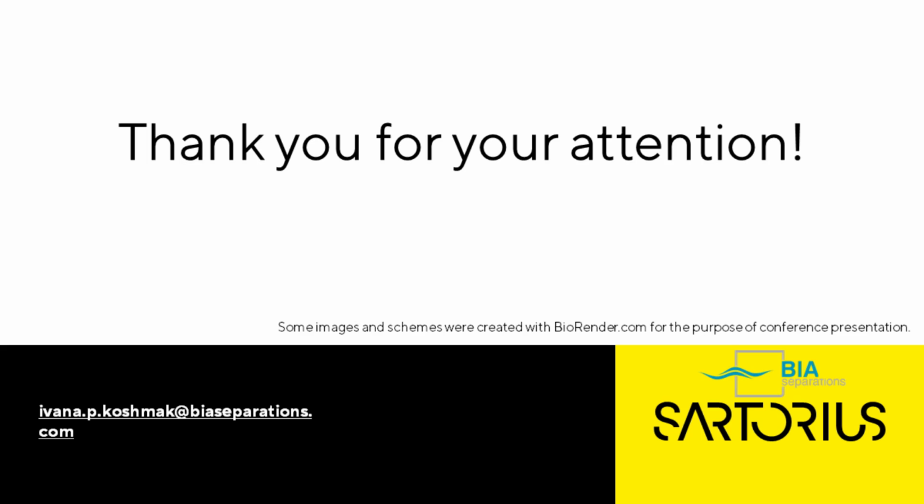Is it possible to characterize AAV without a MALS detector? Yes, it is possible. So, as you could see on one of my slides, when the titer of AAV in your sample is high enough, that is, when the quantity of your AAV is higher than the background, you can reliably use UV signal. However, when the titers are lower, and our LOD is about, let's say, 2E9 total vector particles per milliliter if you use the maximum volume of the sample, in that case, we prefer to use MALS because of higher sensitivity. Otherwise, if you have good concentration already in your sample, you can definitely use UV 260 and 280. I just have to note that in that case, you need to use a correction factor. Also for MALS, you need to use one because the empties and the fulls will have different extinction coefficients.